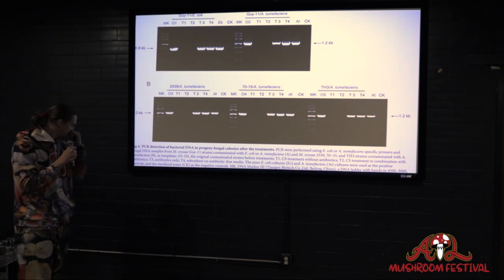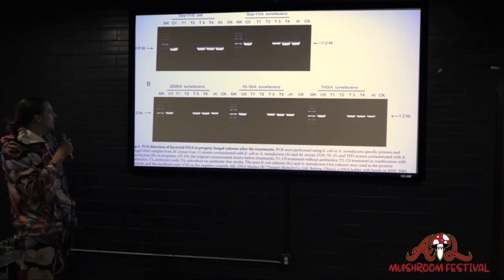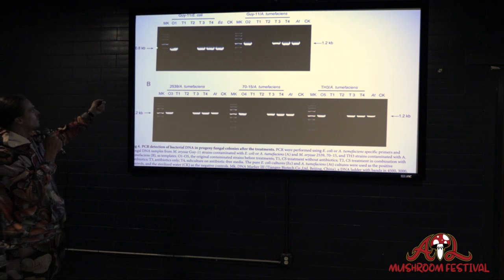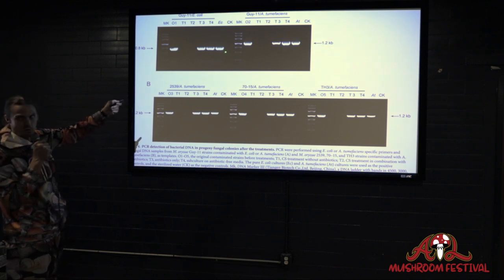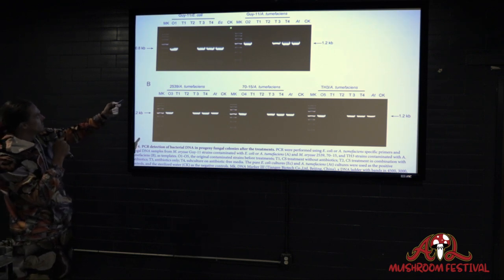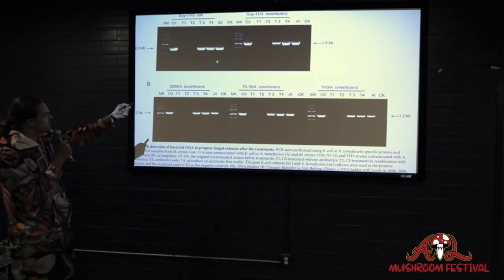And so here you can see the results from the gel electrophoresis after PCR amplification. And you can see with T1 and T2, there's no bar. So this E. coli is the standard. And so this is how you can tell whether it was present or not after amplification. And then the CK is your double distilled water, your negative. So this should always be clear. This should always be the same.